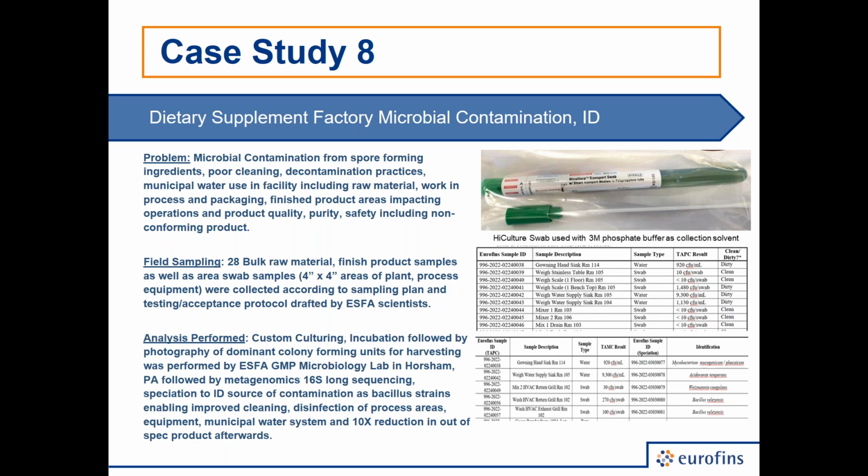Case study 8 was a different factory that had microbial contamination problems, and they wanted to know, gee, was it in the water? Was it in the raw materials? Was it cleaning and sanitation? Was it human beings, spit or bodily fluids that somehow were getting into things, or another source of contamination?